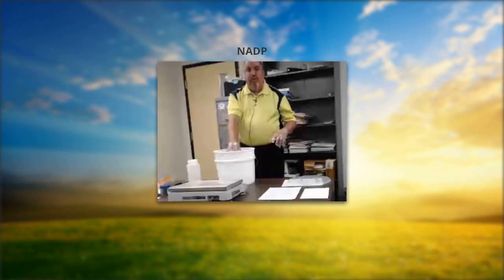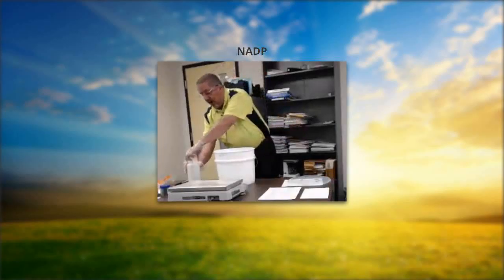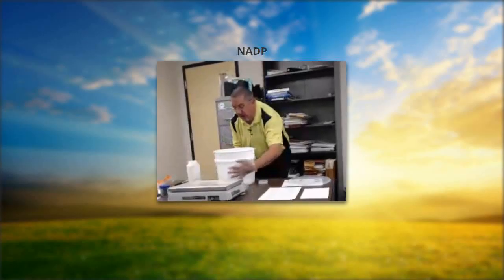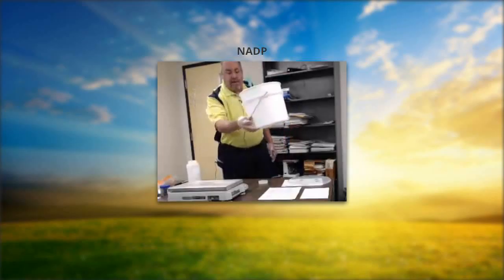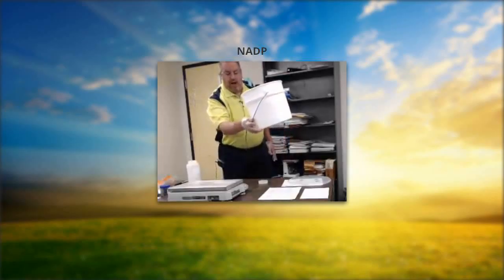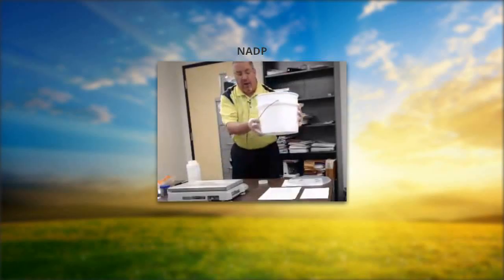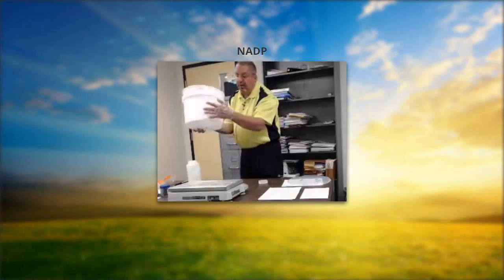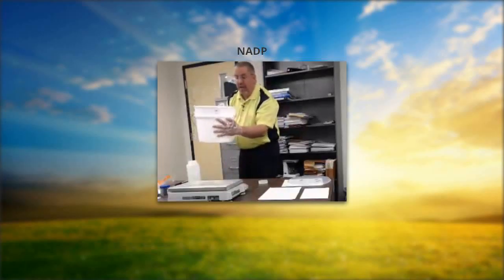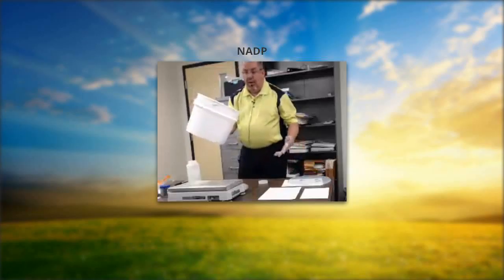Never reach into the bucket or bottle to remove debris. I'm going to start the decanting process. For a heavier sample, you might think you can handle it one-handed, but be very careful. I always support it with two hands: one hand on the handle holding it down, the other hand cradling and supporting the other side so I'm always in full control.